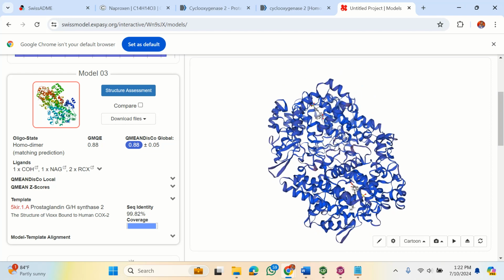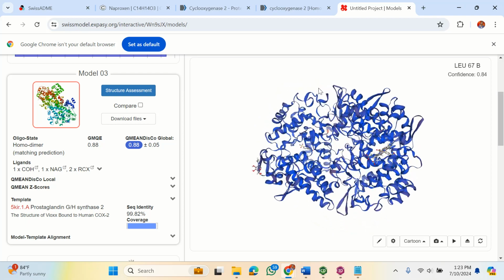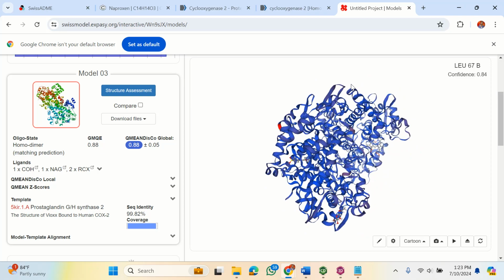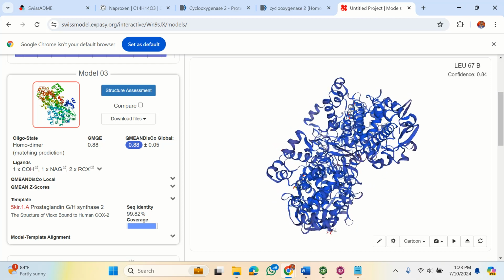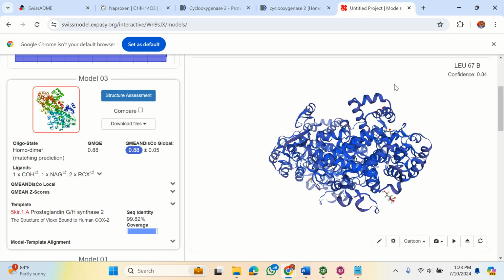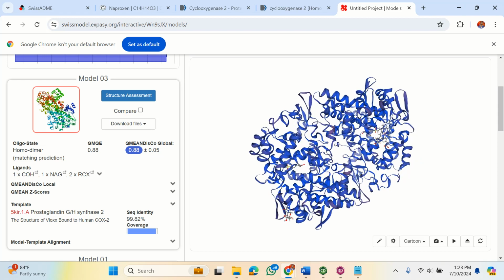So this is the protein. I think this is a double chain though. Yeah, this is a double chain. See the heme group. Do you see that heme group? Then see the ligand. This is not actually naproxen. This is another ligand, right? Is it naproxen? It's not. There's up to 3 benzene rings here. However, when you open it up, you see what the substrate or inhibitor there is.